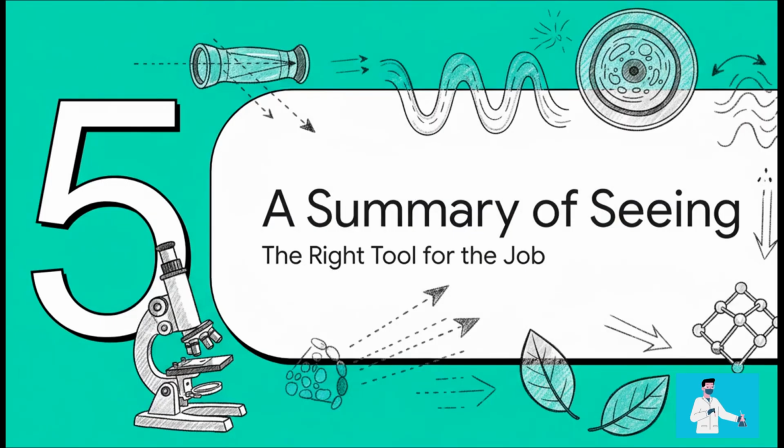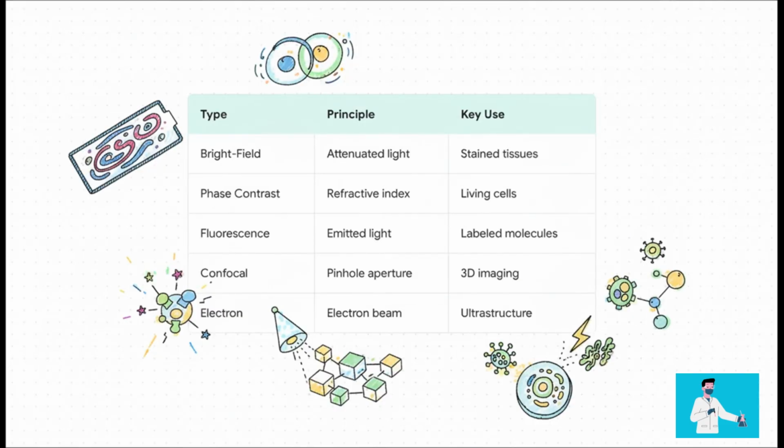Wow, okay, we have covered a lot of ground, from simple glass lenses all the way to powerful electron beams. So let's just do a quick recap of the right tool for the right job. This table is a great little summary. Bright field, that's your basic everyday tool for looking at stained tissues. Phase contrast, like we saw, is the hero for observing living, unstained cells. Fluorescence lets us track specific molecules by making them glow.